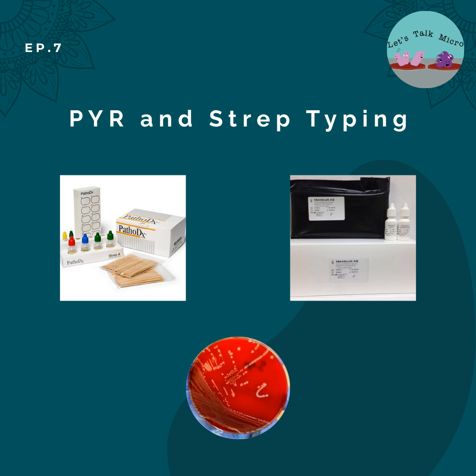So the coagulase is used to differentiate Staph aureus from other staph, which we call the CNS, coagulase negative staph. And then your catalase is between staph and strep. Always start with a gram stain first. Always. That's one of the most important tools. So you can actually perform a catalase on other organisms that are not gram-positive cocci. You can use it on gram-positive rods.